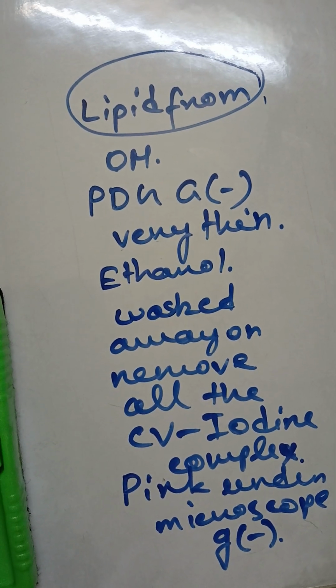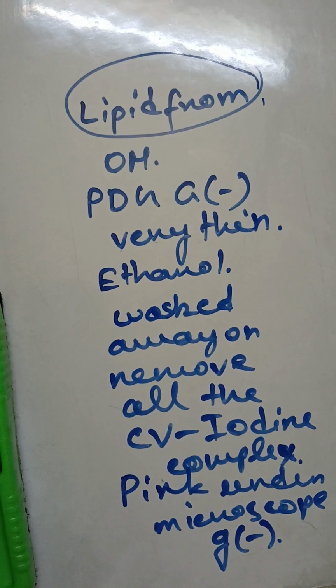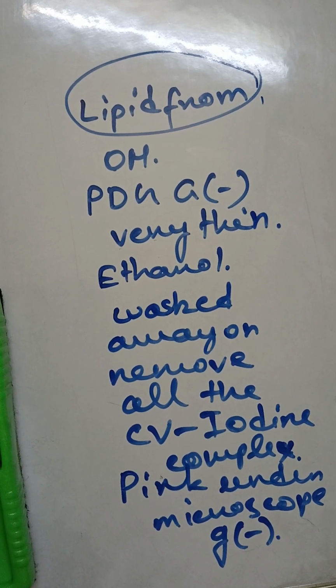So this is basically the basics of the gram staining to differentiate between the gram-positive and negative bacteria.